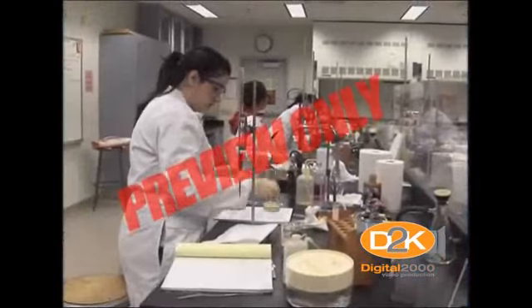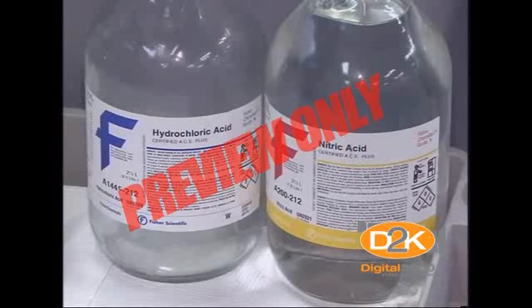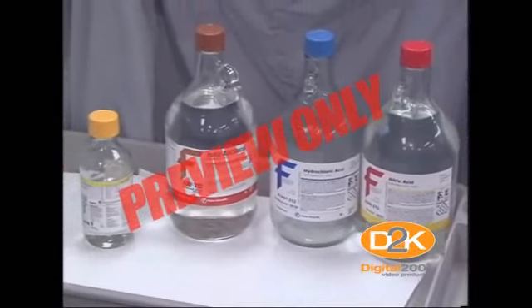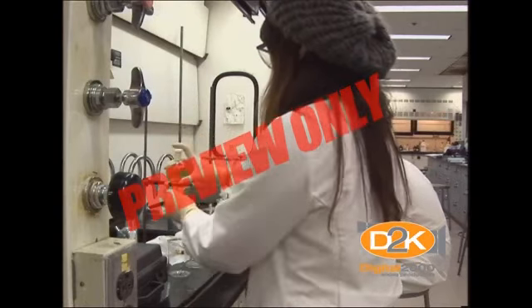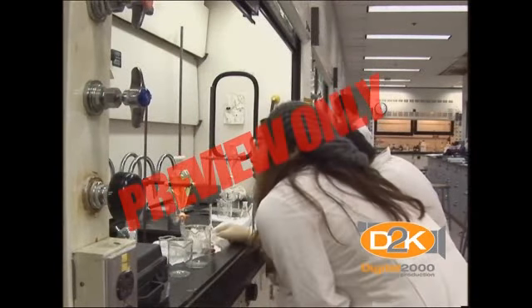Our last topic is chemical hazards in the university laboratory. The hazardous nature of a chemical is determined by the potential for the chemical to cause adverse health effects or toxicity and the physical hazards inherent to the properties of the chemical, for example, a chemical's flammability or reactivity.